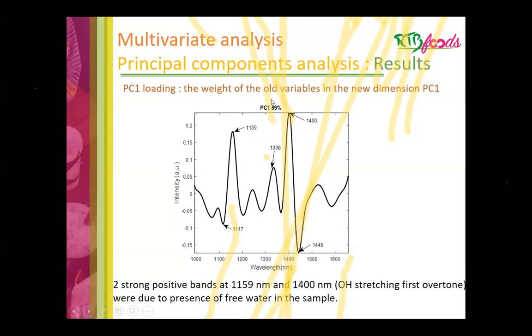But I took PC2, principal component 2, that is really different, because it is another component. This is just for principal component.